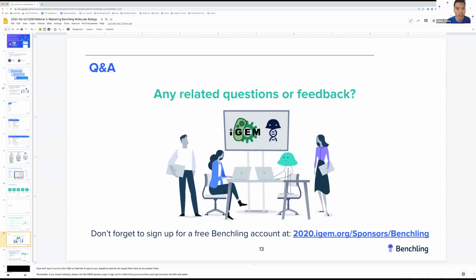So one question asked is, why was there a mismatch? Does that mean the construct would not work experimentally? How are we meant to deal with and solve mismatches if we find any? Yeah, so I think this is relating to the sequencing tool. If you do find a mismatch within your particular design sequence, we are assuming that you experimentally created that particular sequence.